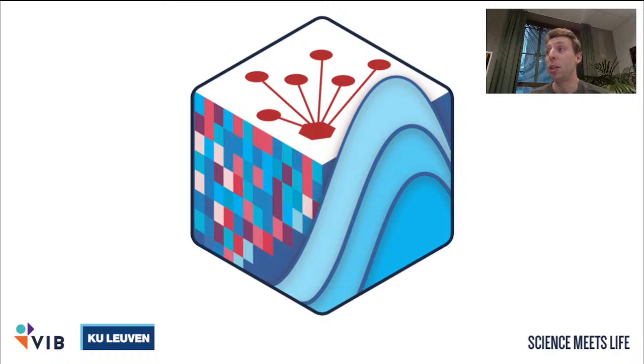For example, you have already run SnapATAC, like some people are commenting on YouTube, and there you have cluster labels for each cell, so you can use those cluster labels. Or you can also run cisTopic first using the screen regions and then perform topic modeling, and then based on those topic models generate your clusters, and then use those clusters to generate cell types.